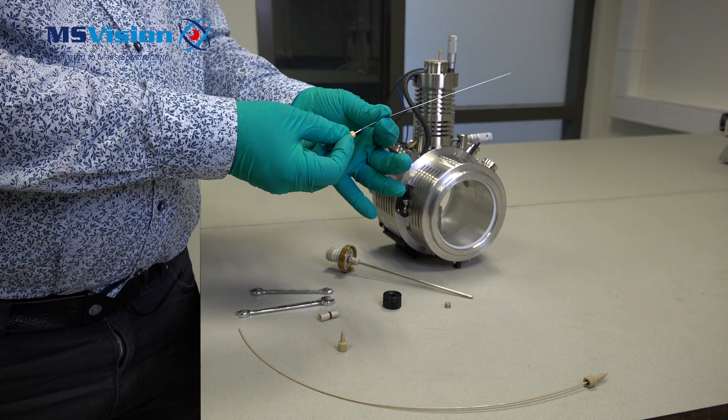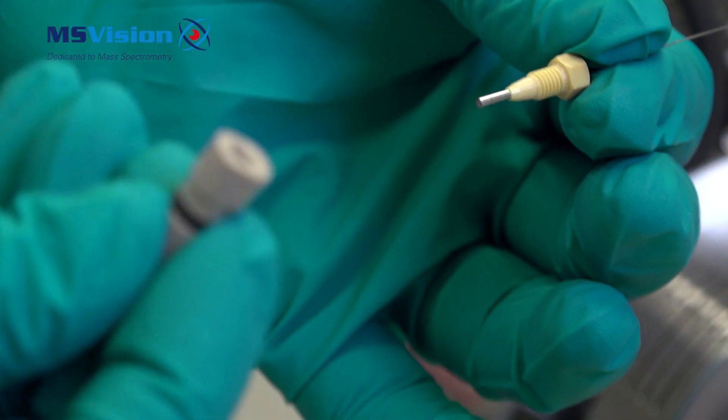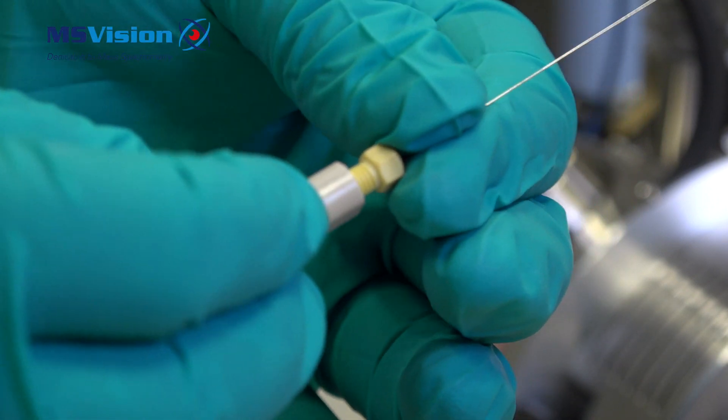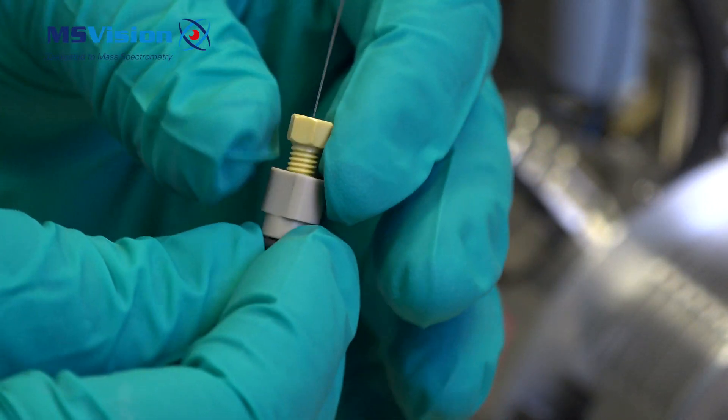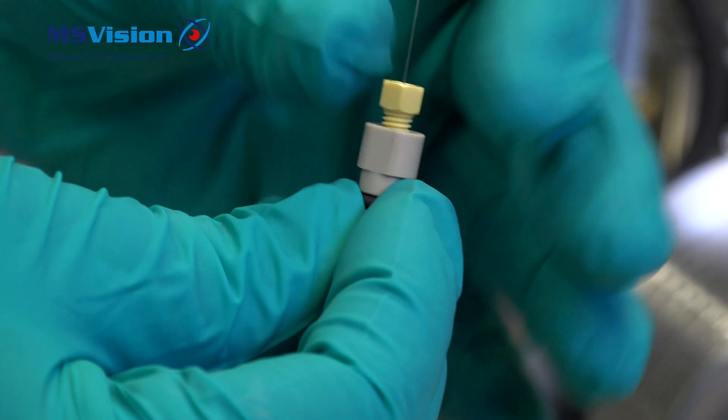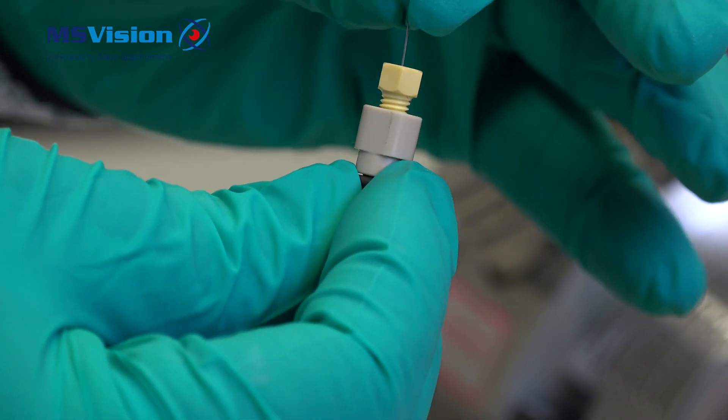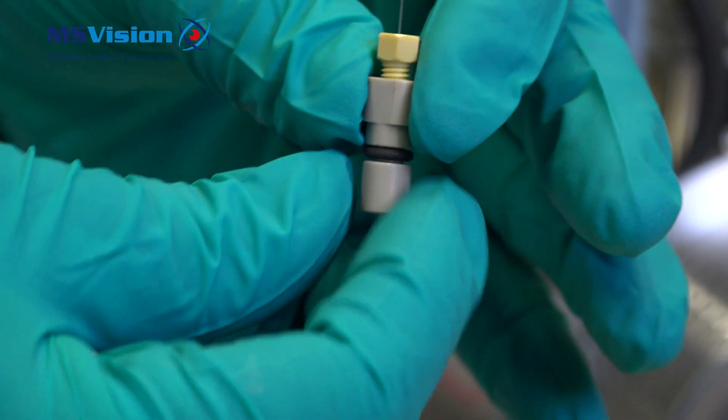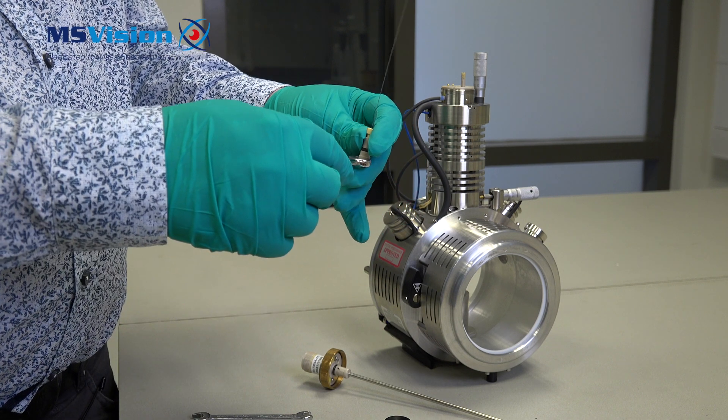Take the new capillary and slide it into the nut, then take the holder and screw it in finger tight. Make sure the capillary is pushed down and then tighten it a quarter turn using the two spanners.